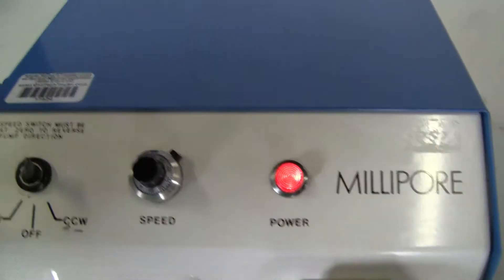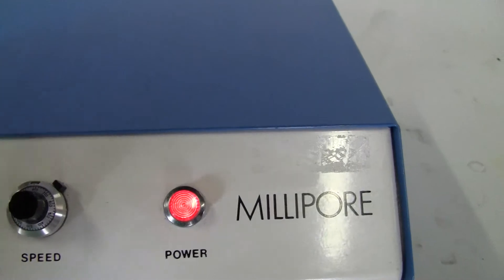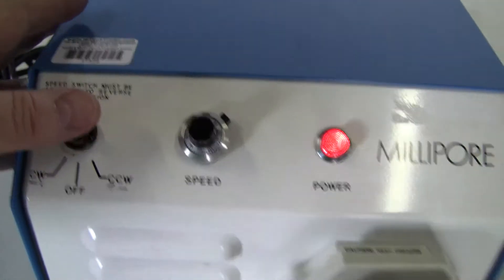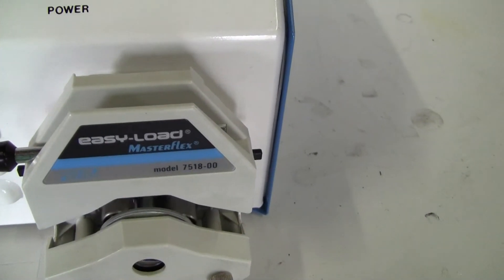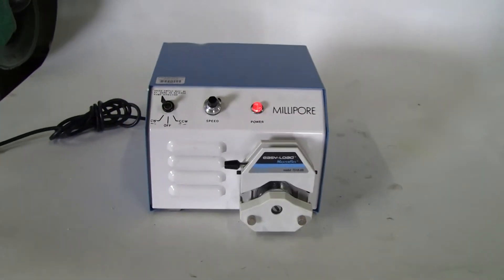Let's see it working. Speed control. And then you can reverse it. And there you go.